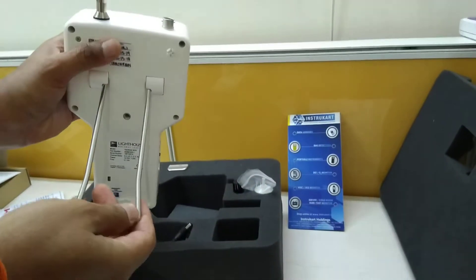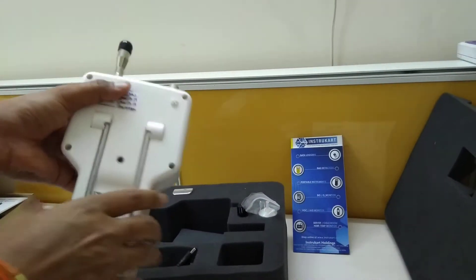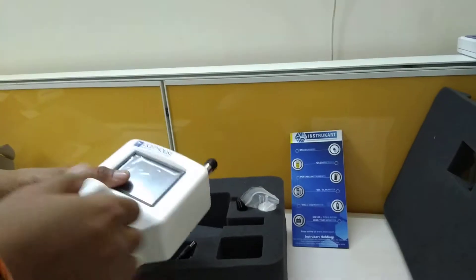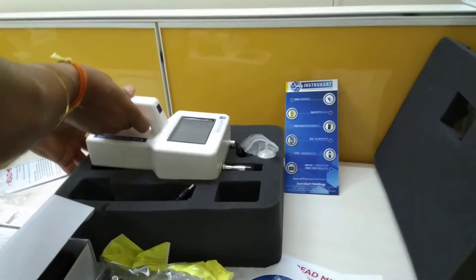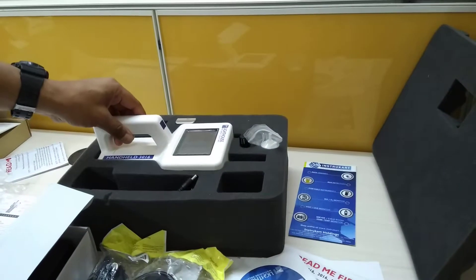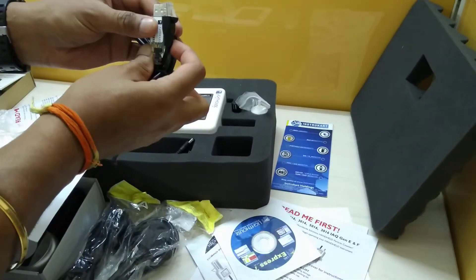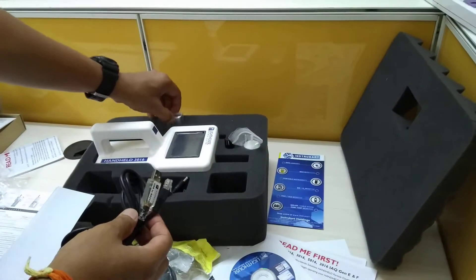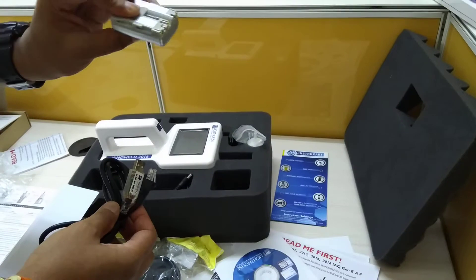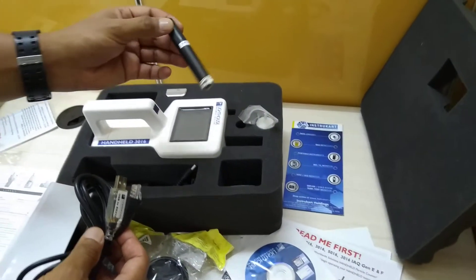This is the kickstand, which you can use for better usability. Along with the instrument, some standard accessories are included — this is the RJ45 to USB converter, and we also have a battery.